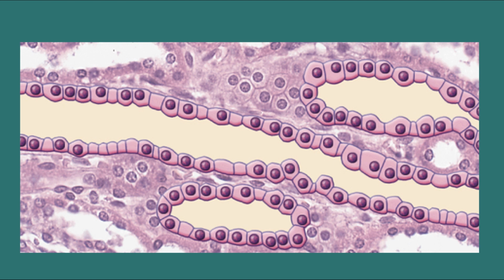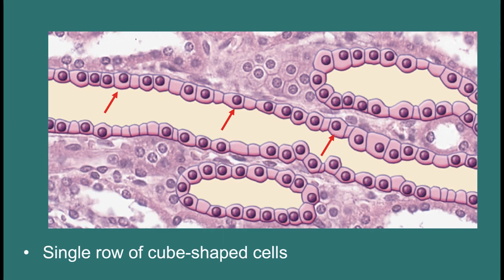All right, so hopefully what popped out to you was this single line of cells on top and here on bottom. We also see a circle right in here, and we see almost a complete circle over here in the top right. Again, in both of these images, we see that there is a single layer, and if we look at these individual cells, they look fairly cube-like.